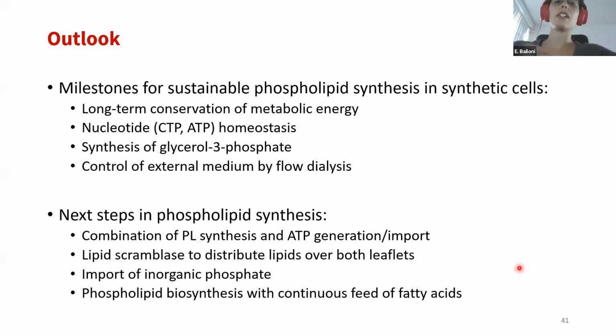We probably will need to also add an importer of inorganic phosphate. I didn't touch on this, but we believe that inorganic phosphate will become limiting at some point in time. And definitely the final step would be to be able to perform phospholipid biosynthesis starting from fatty acids that are fed in a diluted fashion in our flow dialysis device.